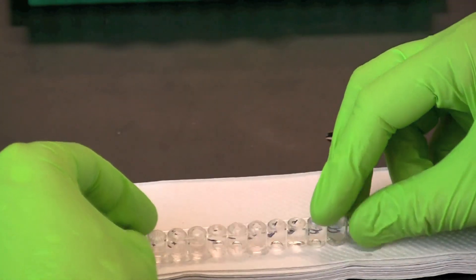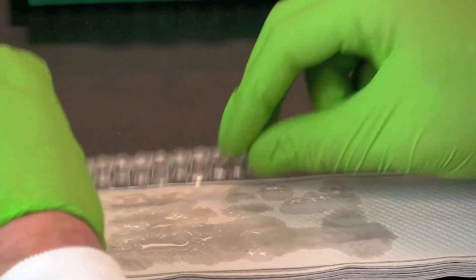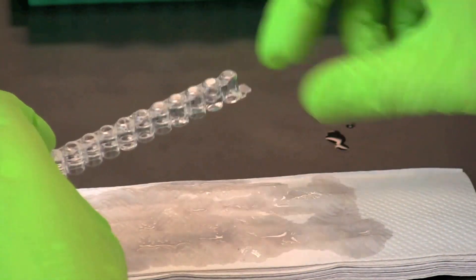Tip the microplate strip upside down onto a short stack of paper towels and gently tap the strip a few times to empty the wells of wash buffer.